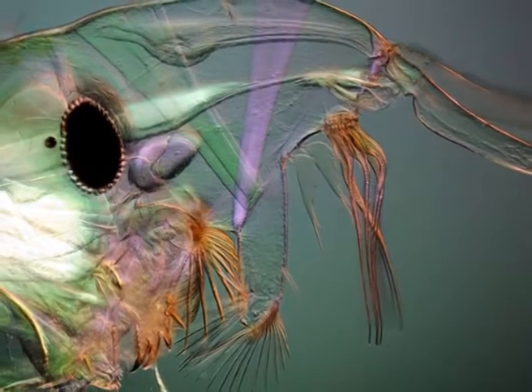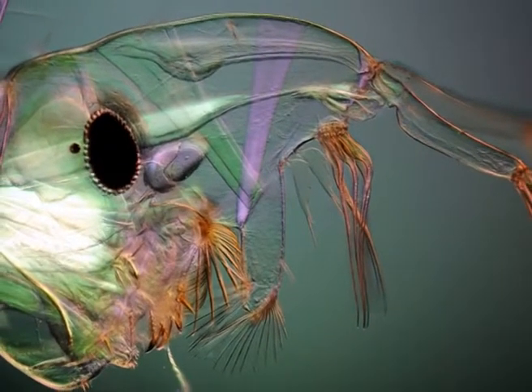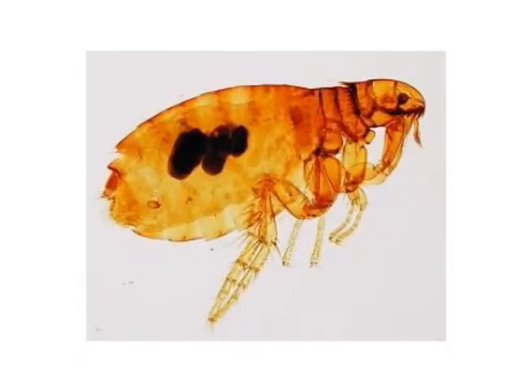Image of a very tiny object captured by photography with the help of a microscope is called a photomicrograph. The technique to get photographs or digital images of a tiny object using a microscope or similar device is known as photomicrography. It is quite different from classical photography. It requires photography skill, scientific knowledge and sufficient experience in the field of photography.